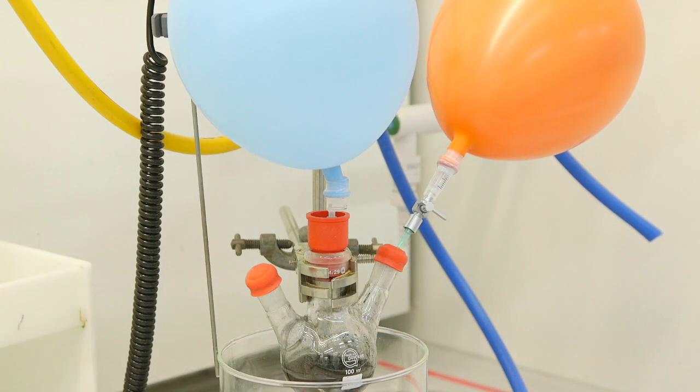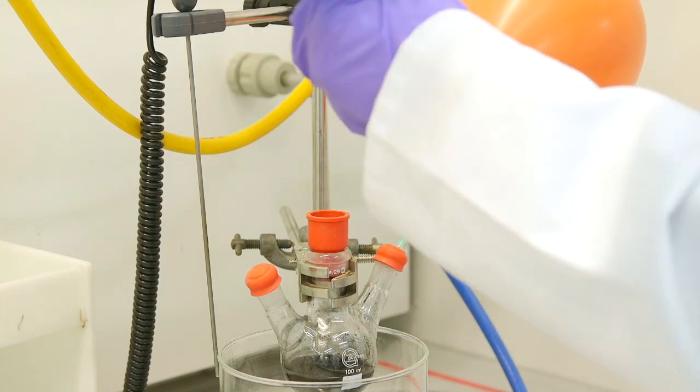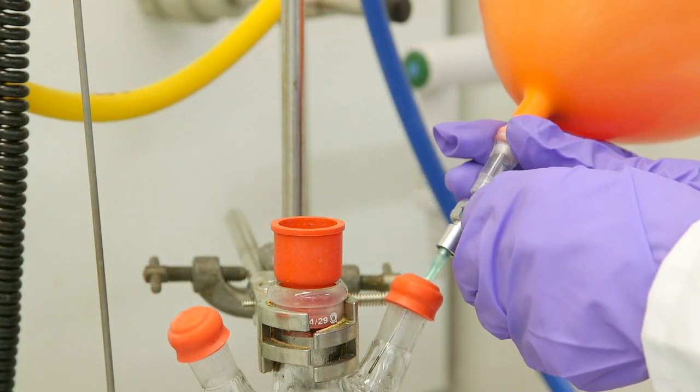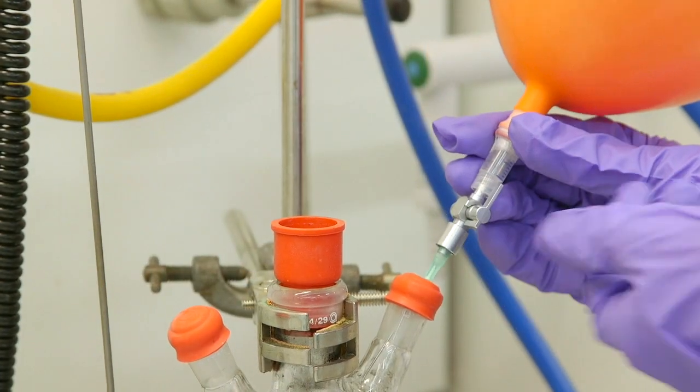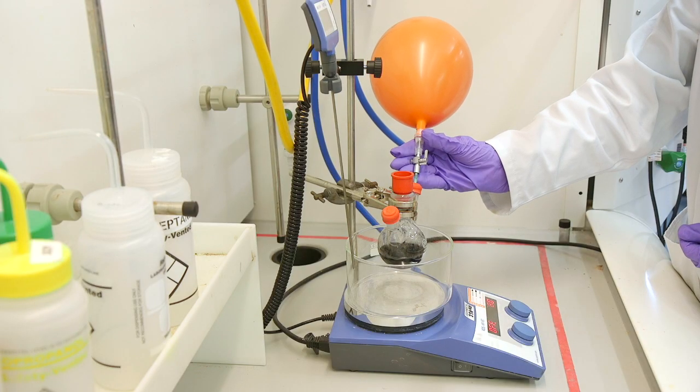We will then re-evacuate one more time and now open up the lure lock to allow hydrogen to pass into the reaction flask. We have now successfully set up our hydrogenation reaction. This can be left until the reaction is complete.